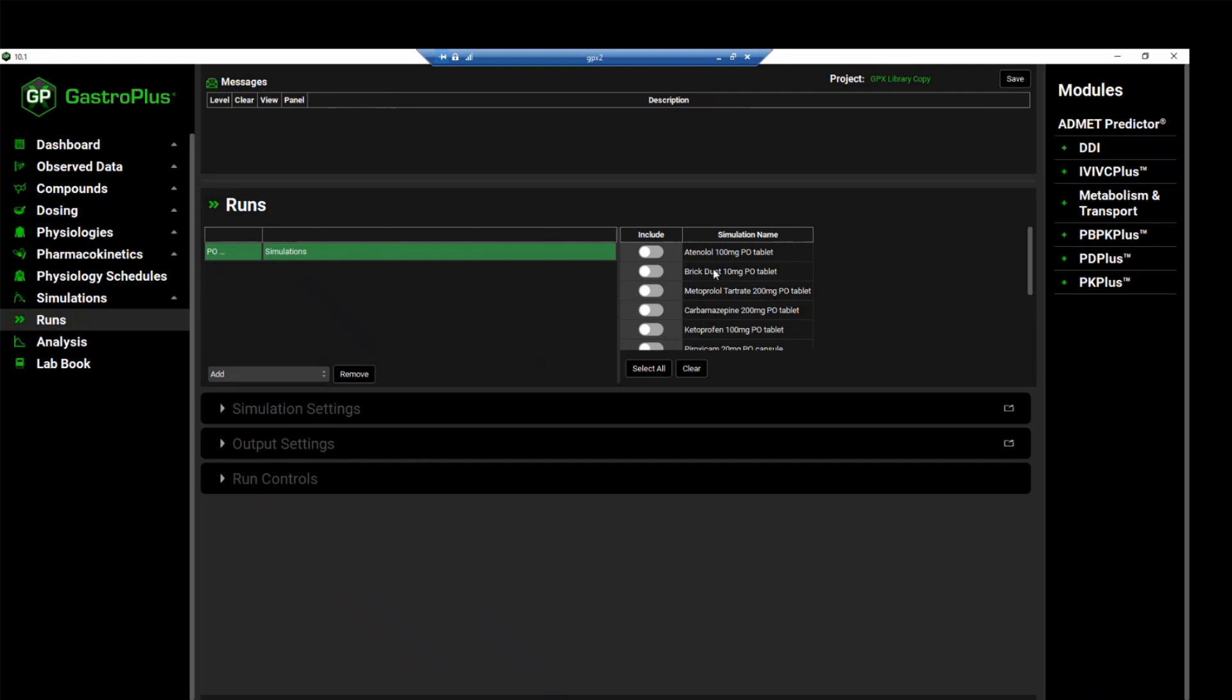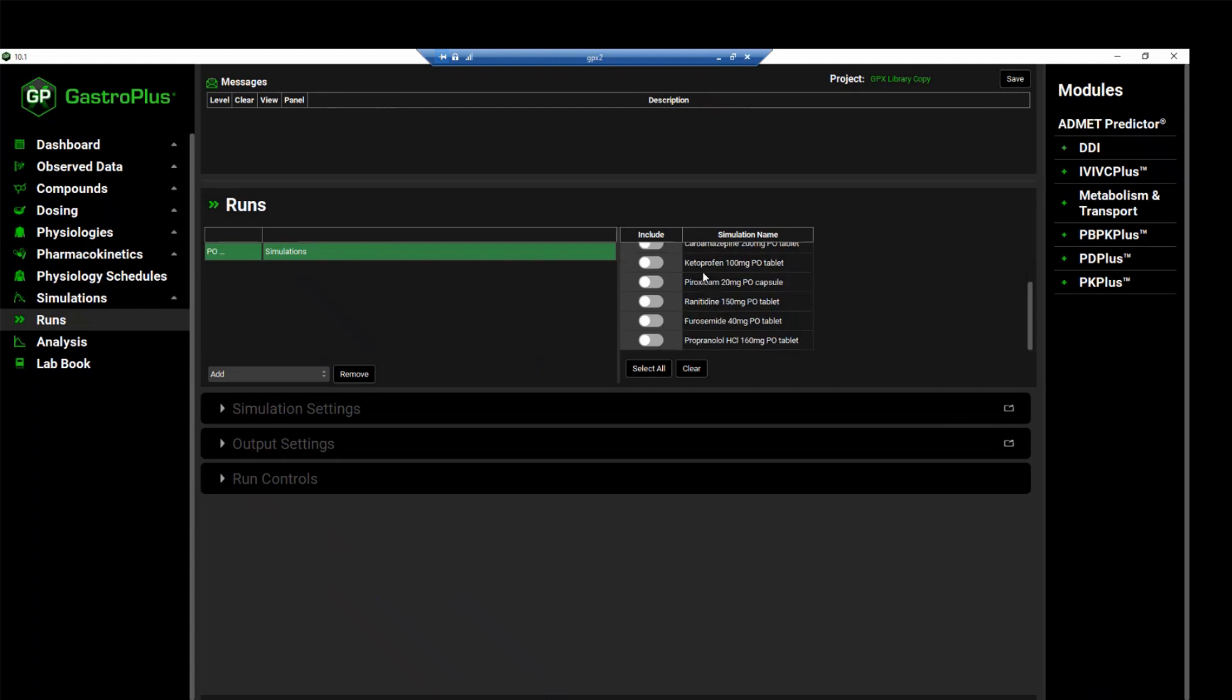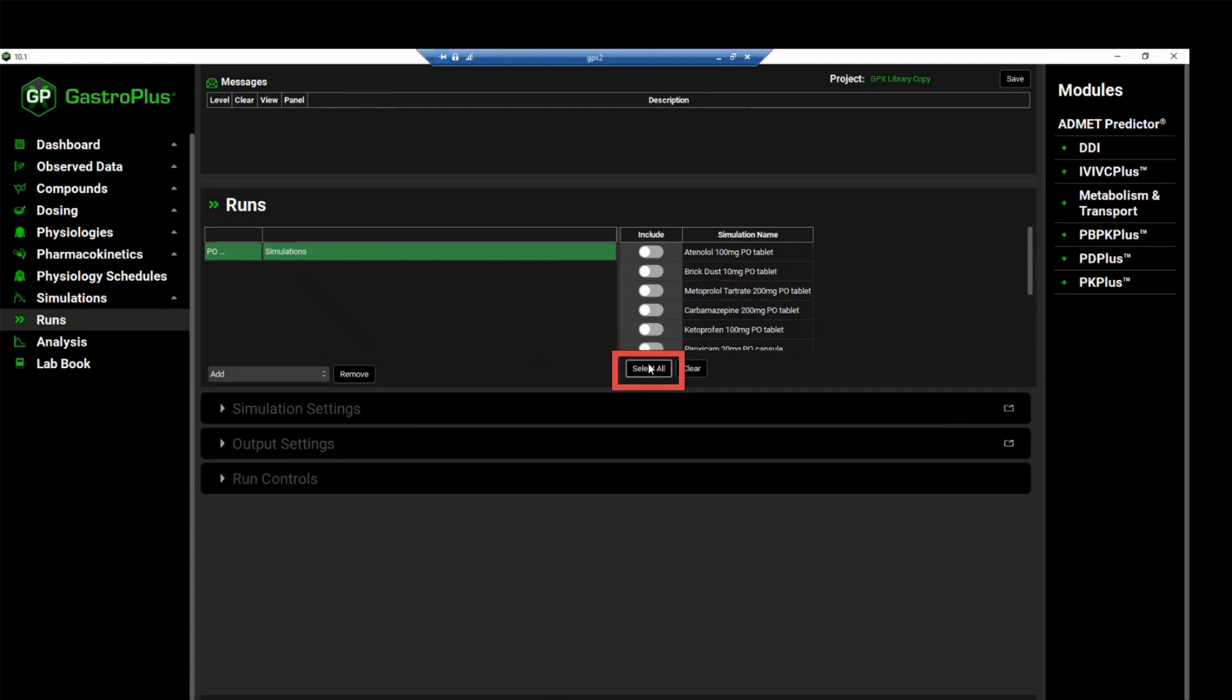To include the simulation, you can either select each toggle for each simulation that you want to include in your run. In this case, we want to include all the simulations that are created in this project. To do so, click on select all.